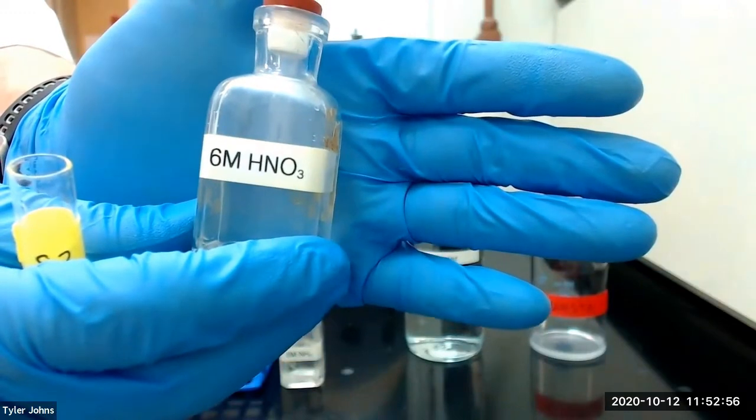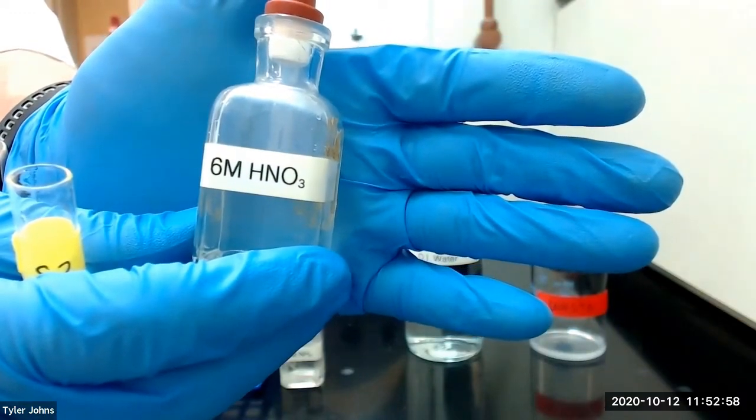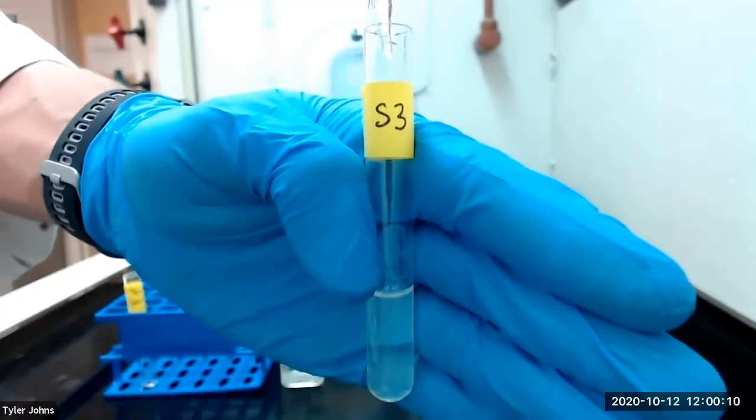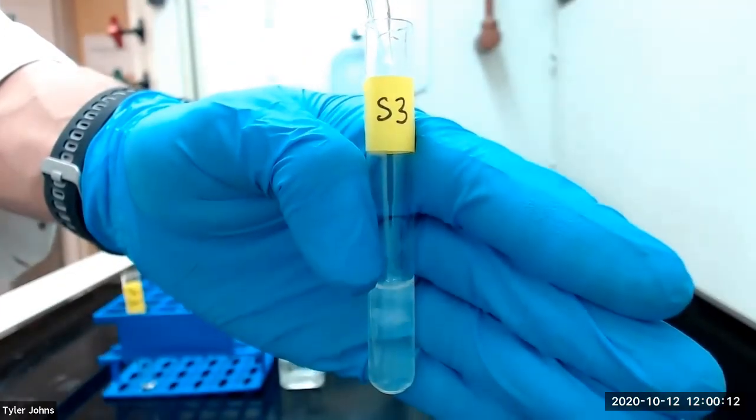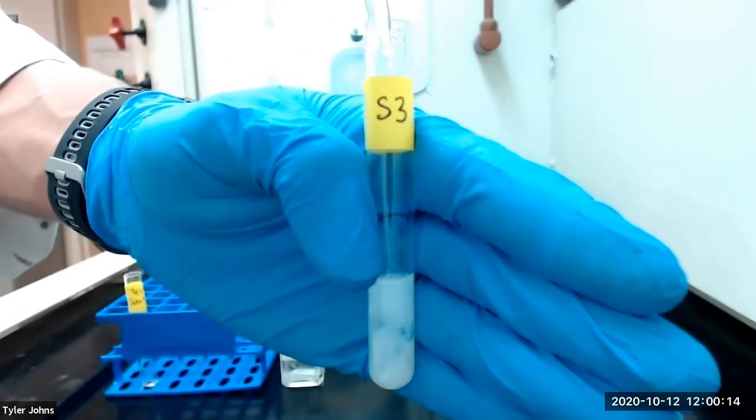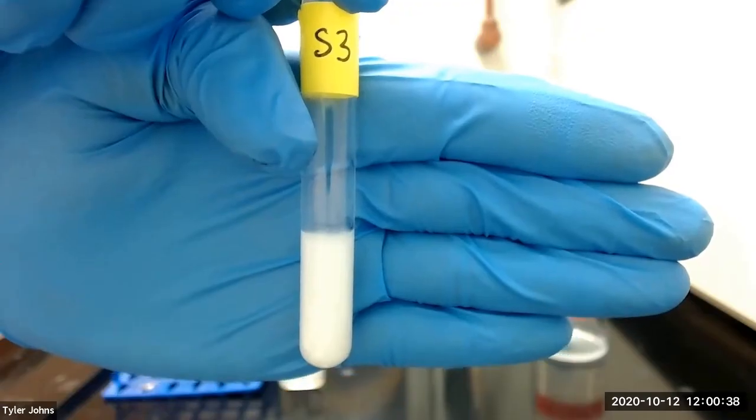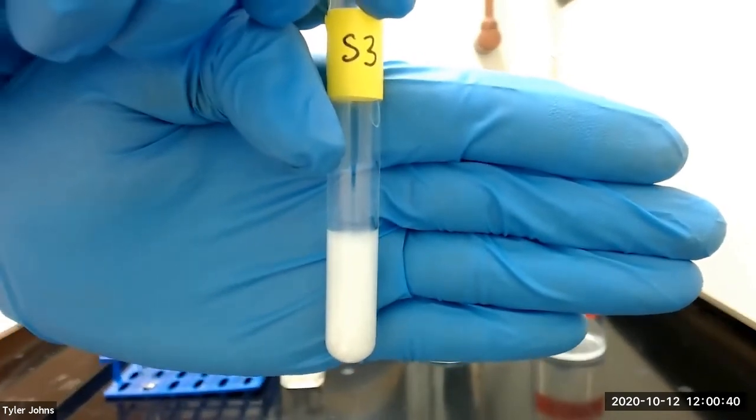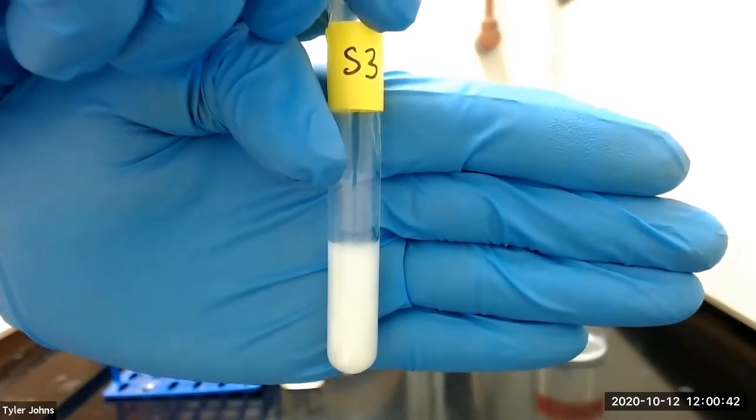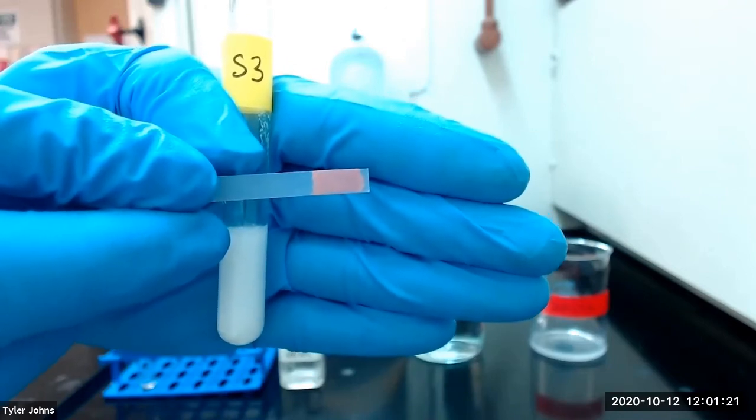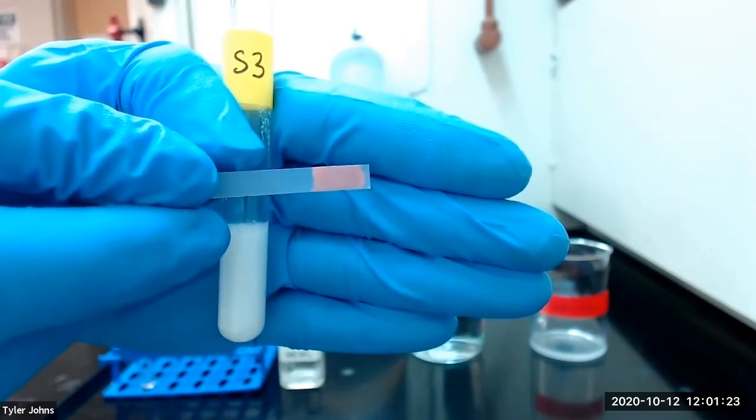The formation of a white precipitate confirms the presence of silver ion. We can see that our solution is now acidic as a blue piece of litmus paper has turned red.